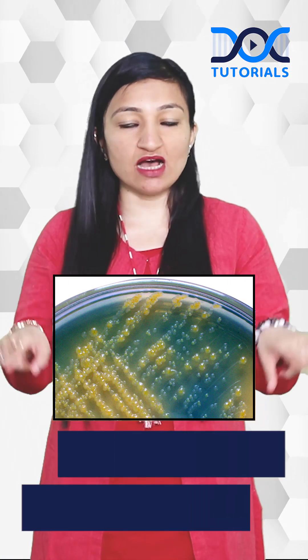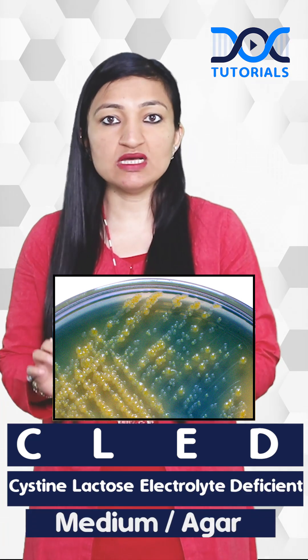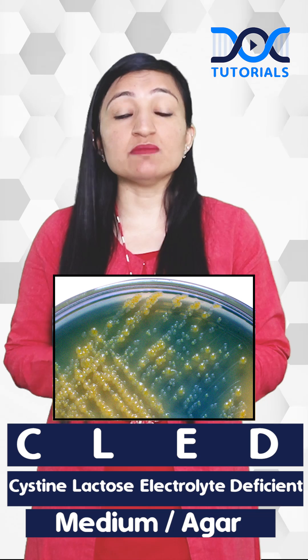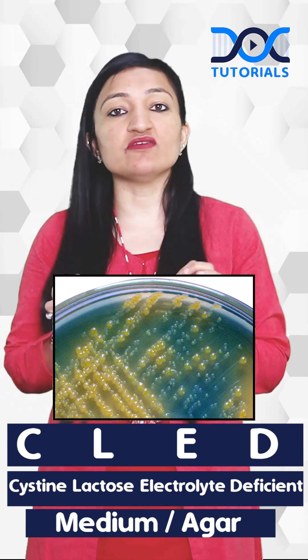This is a picture of CLED agar, or CLED medium — Cystine Lactose Electrolyte Deficient medium — the best medium for growing uropathogens.